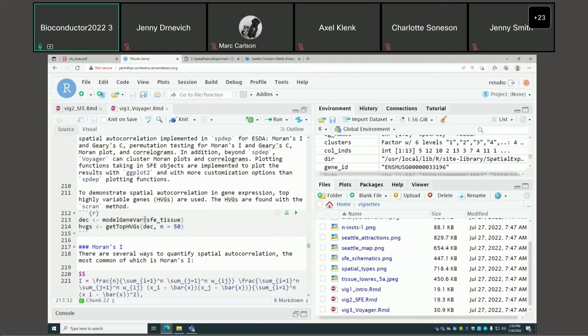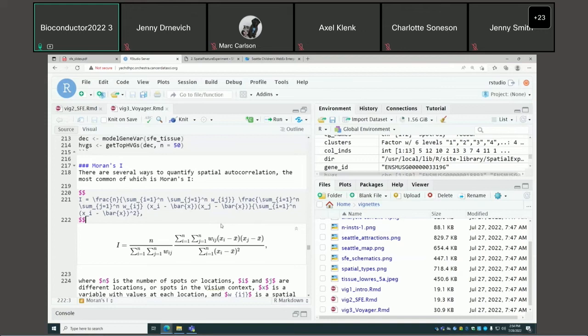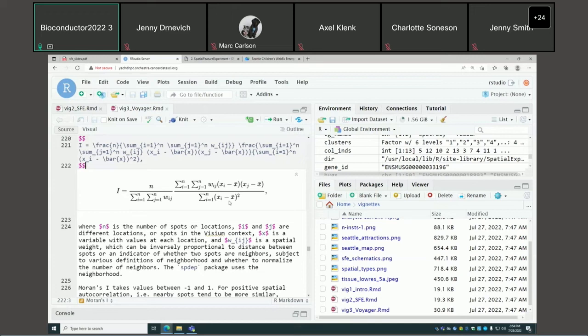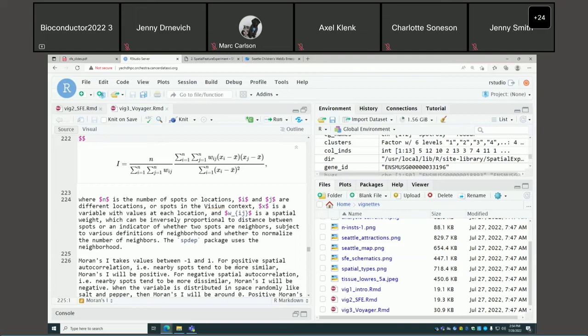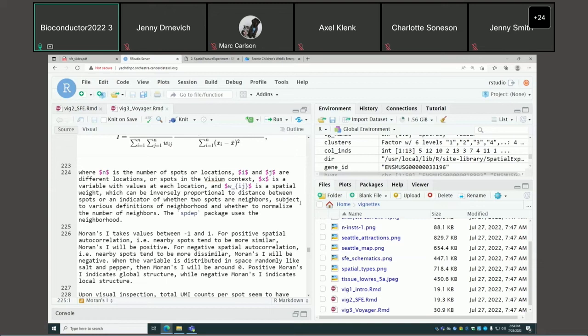To demonstrate the analysis on gene expression, we use a small number of top highly variable genes. Moran's I is the most commonly used spatial autocorrelation metric. Mathematically, it looks like a Pearson correlation between the value at each spot and their neighbors on the spatial neighborhood graph. Like Pearson correlation, it takes values between -1 and 1. Positive spatial autocorrelation means nearby spots are more similar, above zero and positive.